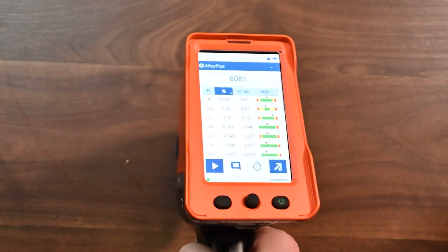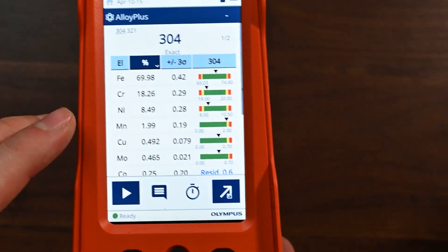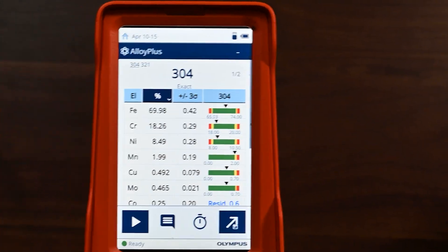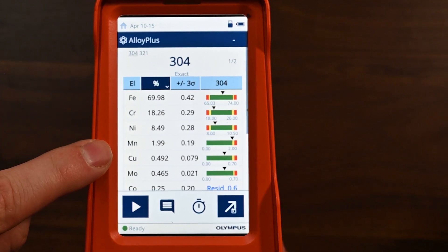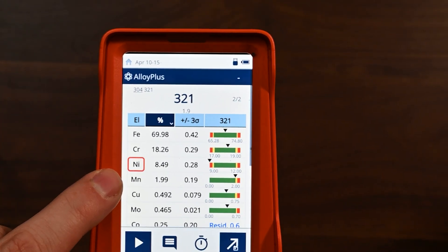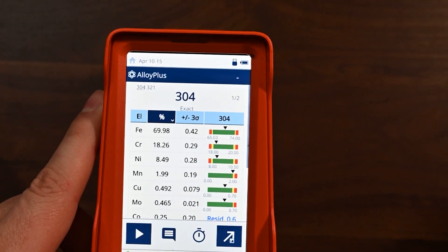Now we're going to run this 304 stainless steel. I pushed the trigger one time. I'm actually going to stop this test here — there's no reason to put the light element filter on because we don't really have light elements. And you can see that was very quick to get a result — we're at 304. All of the major elements are here including iron, chrome, nickel, manganese, copper, and molybdenum. They're all within acceptable range. The secondary match is 321 stainless steel, but you'll notice that the nickel is too low and we really don't see the titanium that we need in 321. So it is prioritizing the right match and able to match 304 stainless steel really easily.